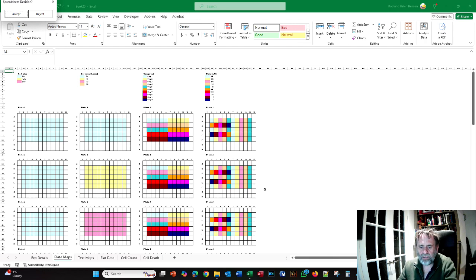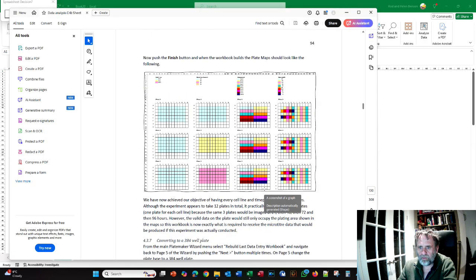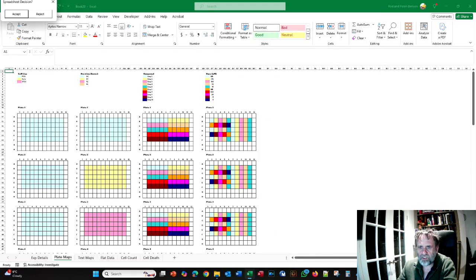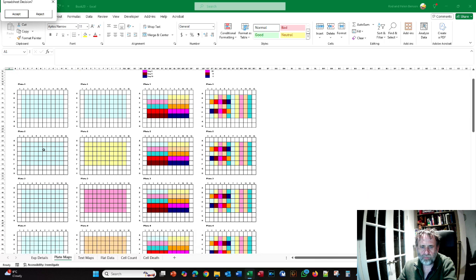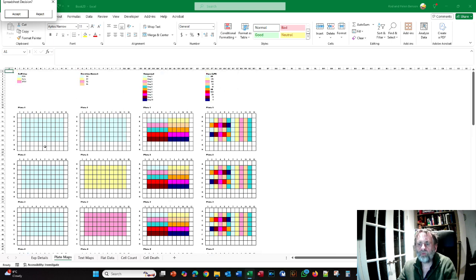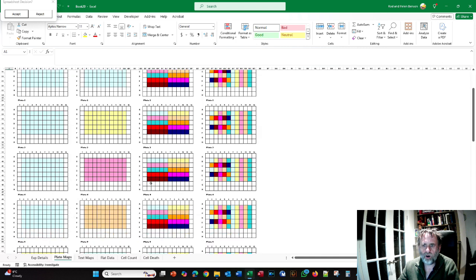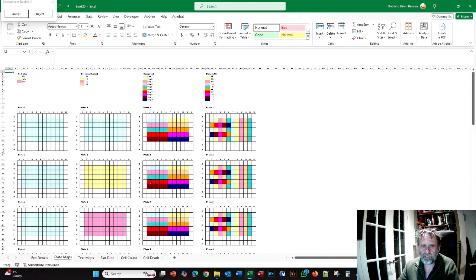you will see that we end up with this figure here, which is now nicely laid out. So you can see we have 24 hours and the cell line PC9, 48 hours and the cell line PC9, and so on and so forth. And this would be a doable experiment on a 96 well plate. So this is the 96 well version of this particular experiment.